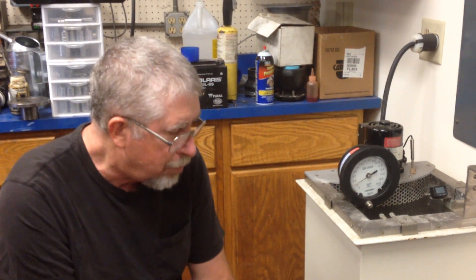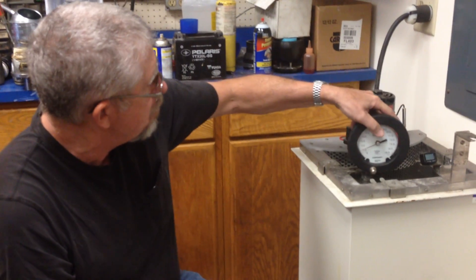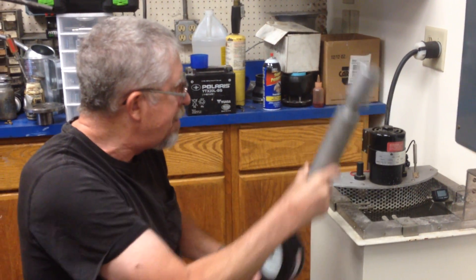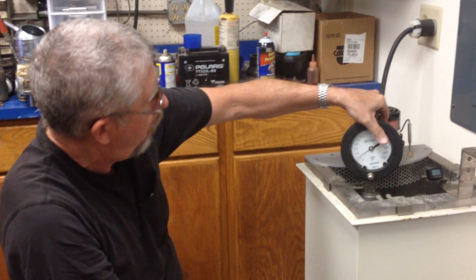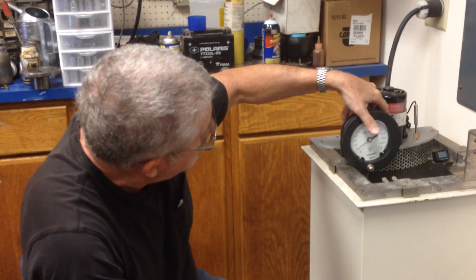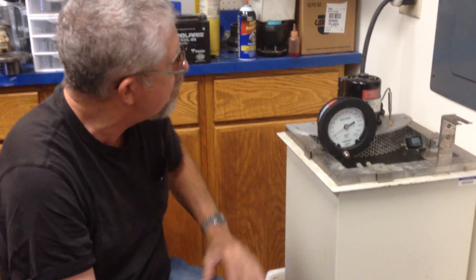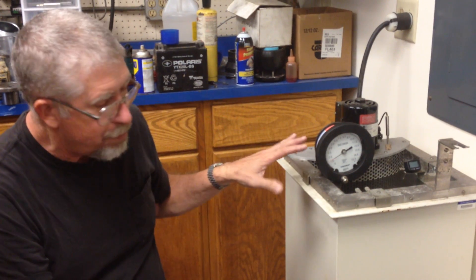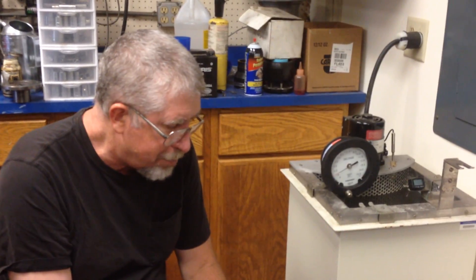We always think a sealed pail is a great thing, but today we're going to be a little disappointed. Part of the RVP test is to agitate and shake it up as much as possible to heat it and get the front ends of the fuel to evaporate and create pressure in the test bomb. If this was really good fuel, we'd be well over 3 PSI and heading towards 4 by now.